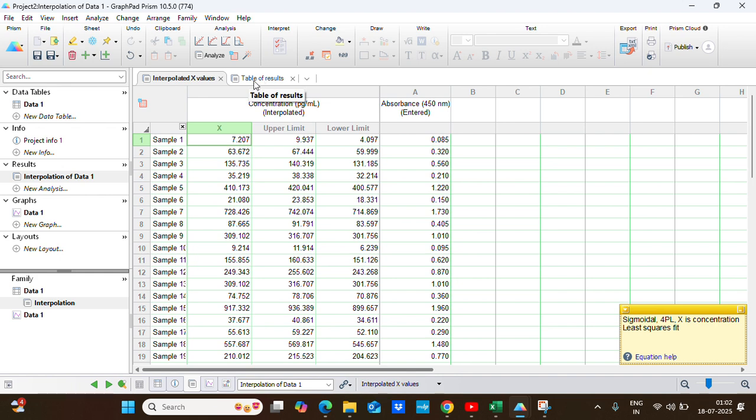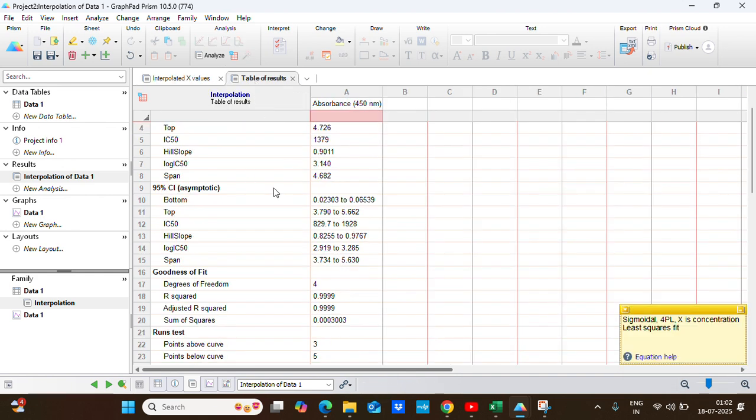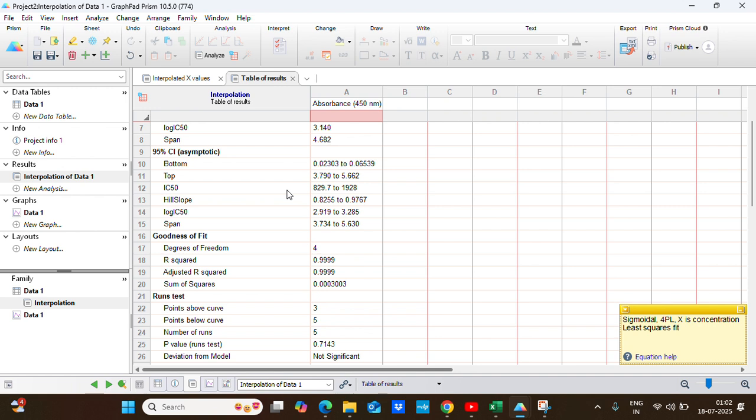The next sheet is the table of results where we are most interested in seeing how our model is fitting to this data. We will go under the goodness of fit where we will see the R squared value. Here our R squared value is 0.9999. As we know, if R squared value is near to one, that model fits best for that set of data.